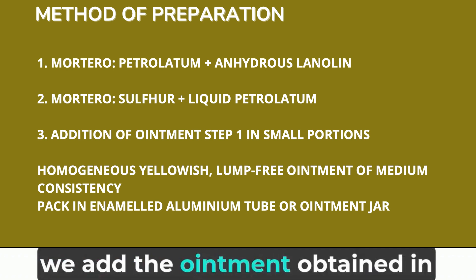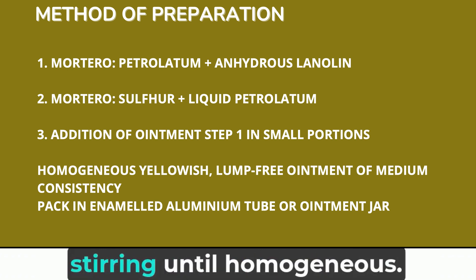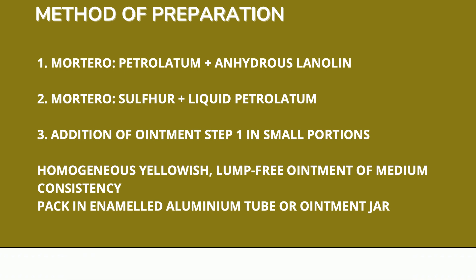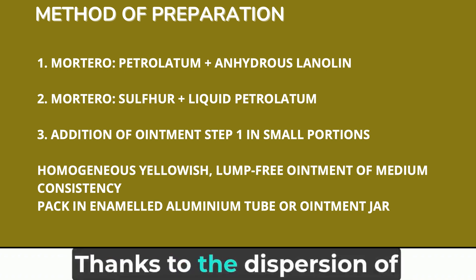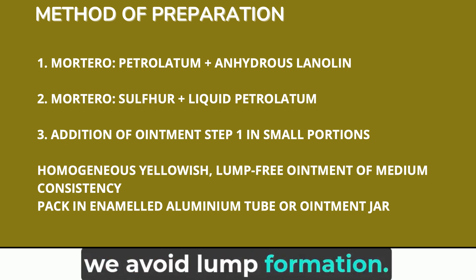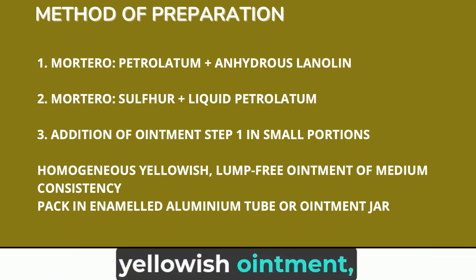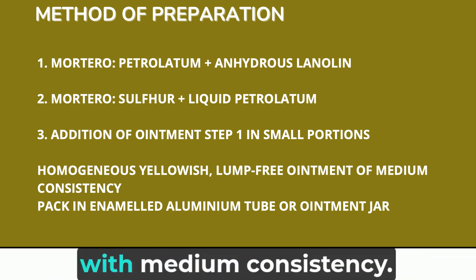Third, we add the ointment obtained in step 1 in small portions over the sulfur paste, stirring until homogeneous. Thanks to the dispersion of sulfur in the liquid petrolatum, we avoid lump formation. We will obtain a homogeneous yellowish ointment, free of lumps, with medium consistency.